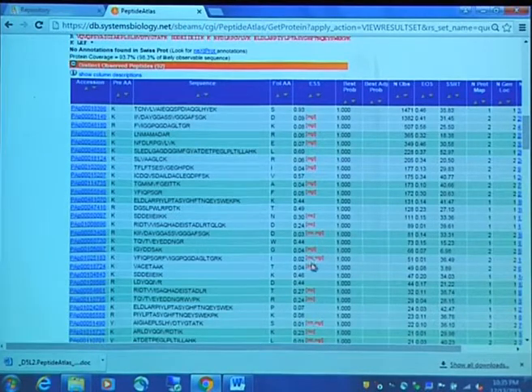Another characteristic of a peptide that would get it demoted is MC, which is missed cleavage, and NTT, which is really number of enzymatic termini. NTT actually stands for number of tryptic termini. And again, ideally you will have 2 enzymatic termini. Whether you're on the N terminus or the C terminus, that counts as one of your tryptic or enzymatic termini. The idea being that we want to have peptides that people will see reproducibly if they do the experiment again.